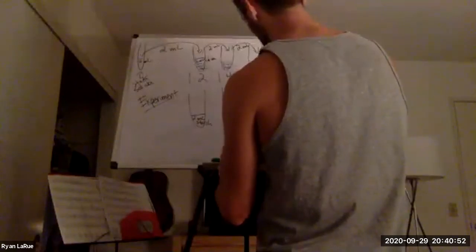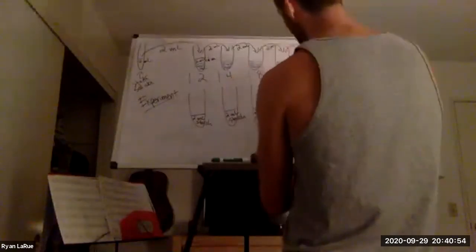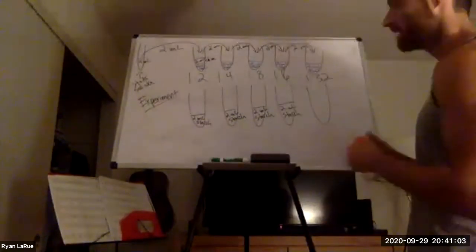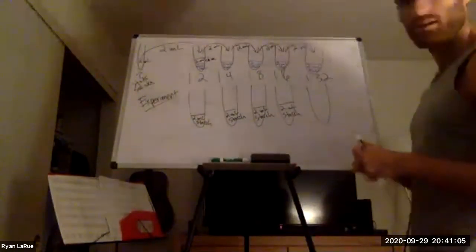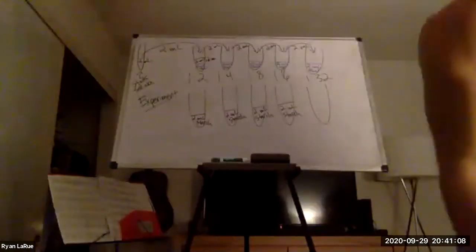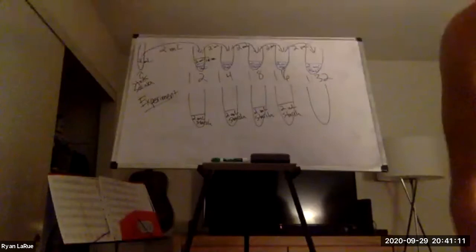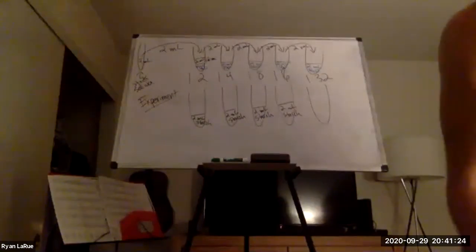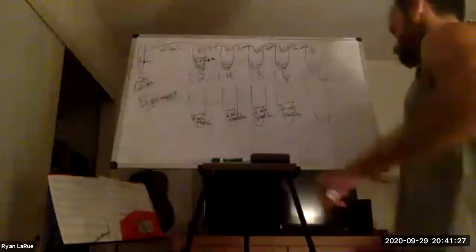Then I'm also going to add two mils of buffer solution. I actually forget why that is. I think it's because the enzyme is slightly acidic. Maybe it affects the rate of reaction. I have to, it doesn't matter. Well, maybe there's a question on it, but I don't know why you add the buffer. It just tells you to. Well, if it asks about it, then I'll certainly look into it. But for our purposes, we don't have to know why.